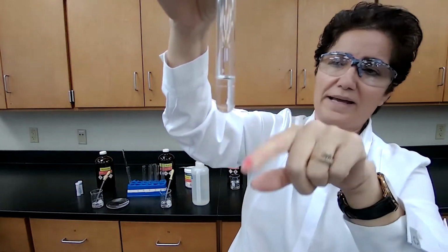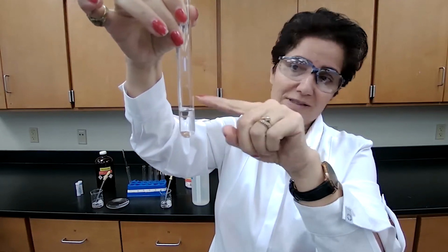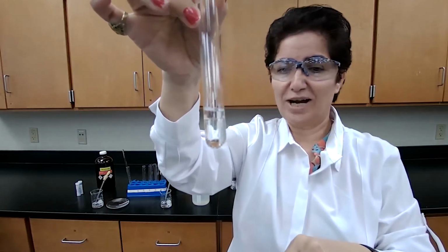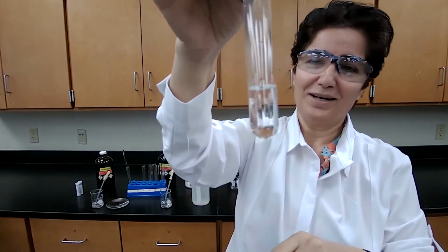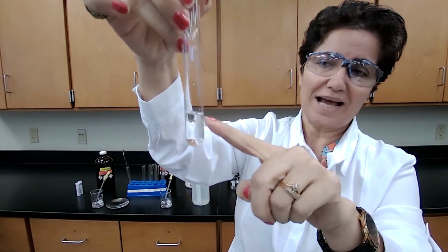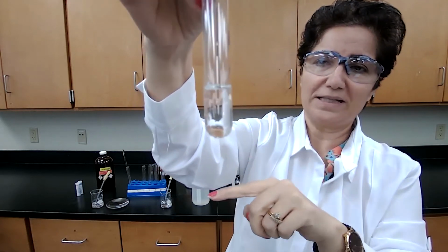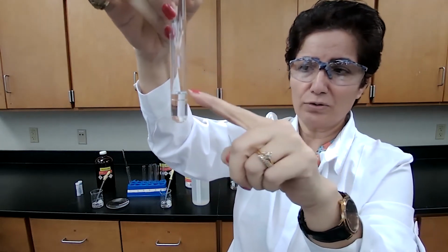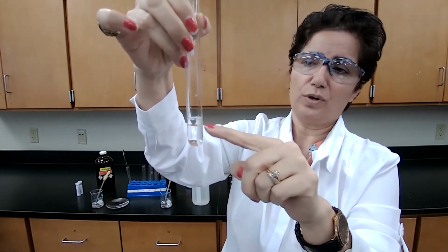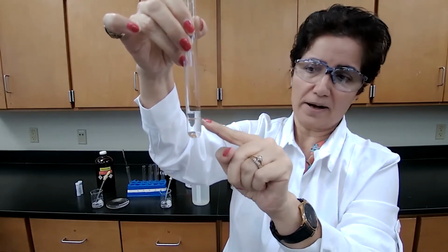If you were in person, even with the 5 drops, I could see the layer, but because it is the camera that is translating this observation to you, it is hard to see when it's a thin layer. So we just add the extra sample and it thickens the top layer. It's easier to see. So if the two liquids are not soluble in one another, they are not miscible, it would show 2 layers. And the one with the lower density would be on top, higher density down.